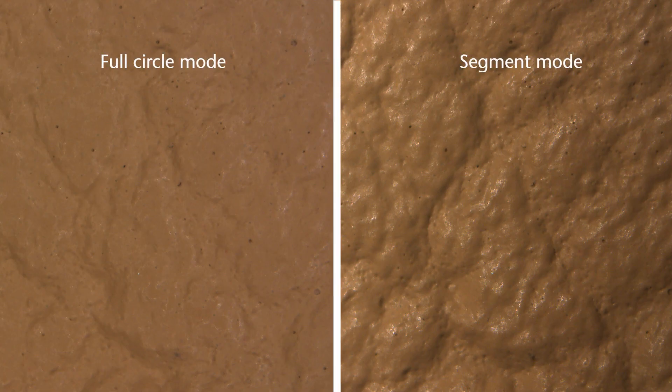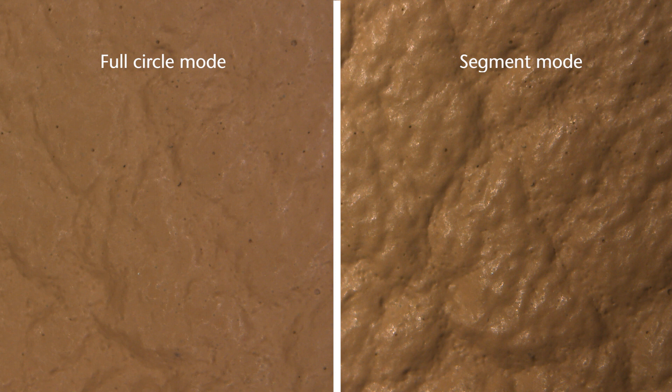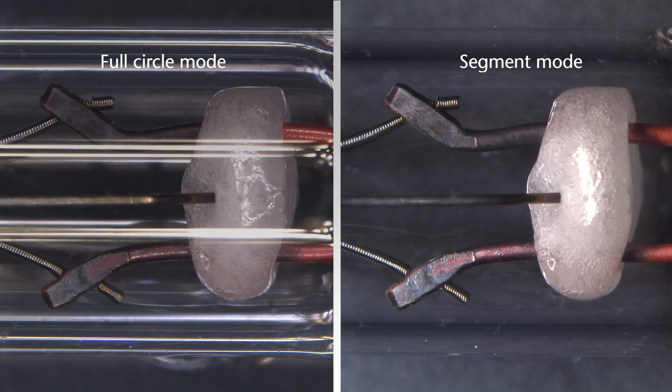Typical fields of application for ring light segmentation include the highlighting of structures such as here on leather, or the avoidance of reflections as shown here on a light bulb.